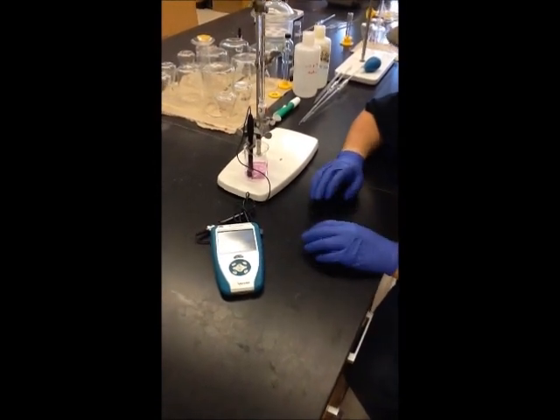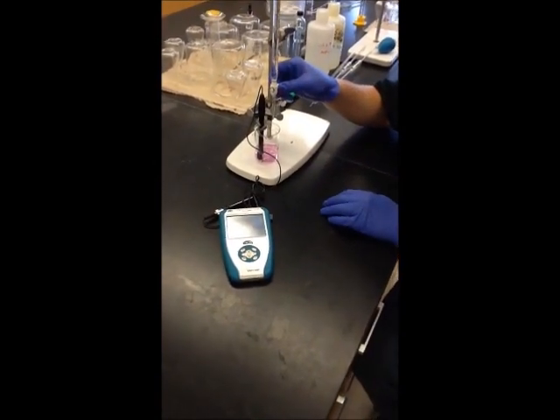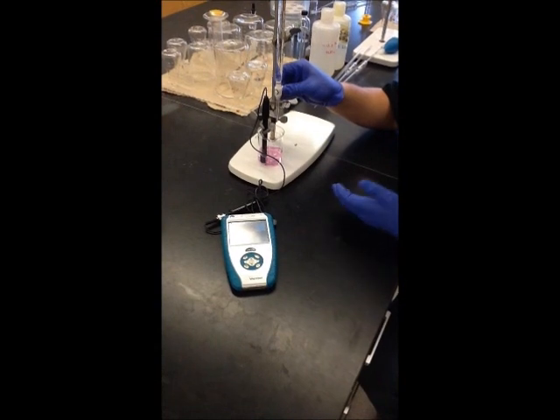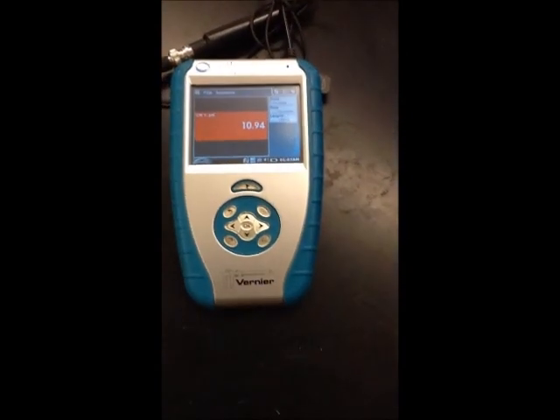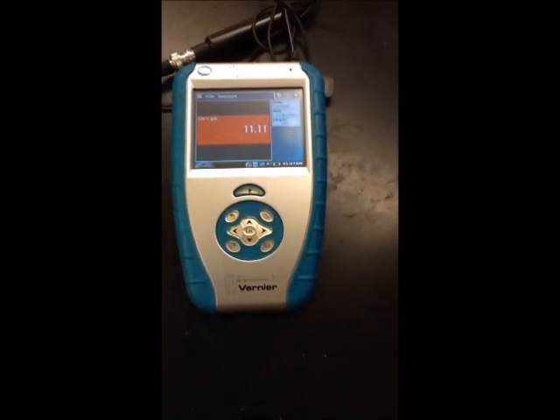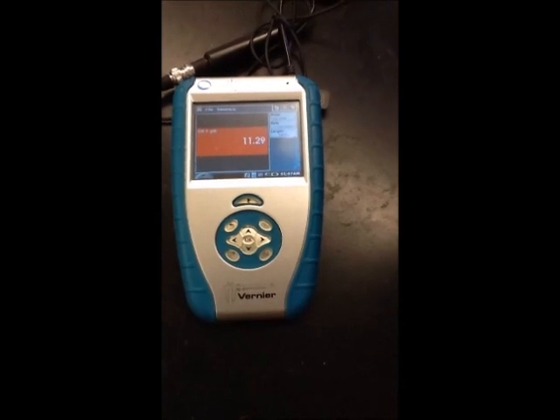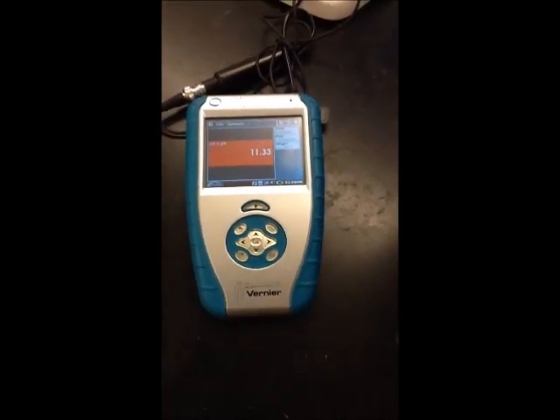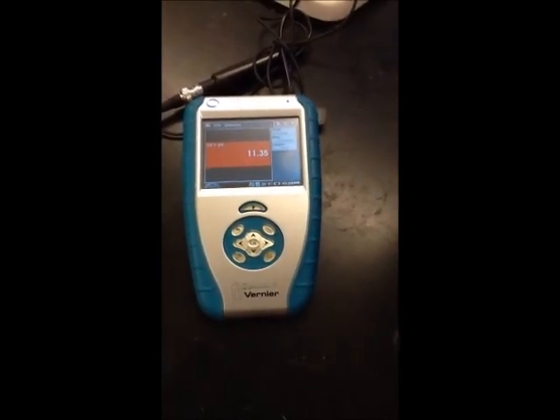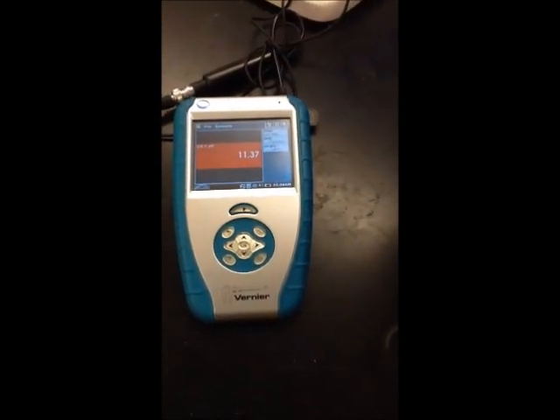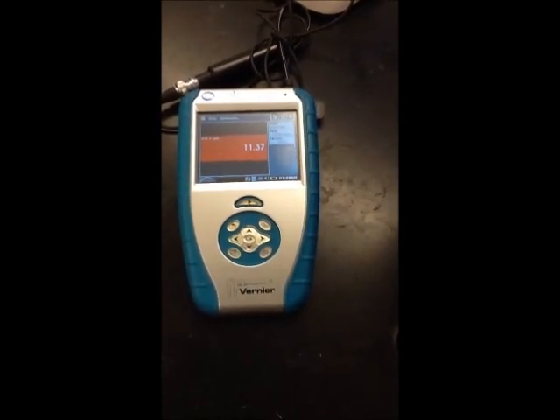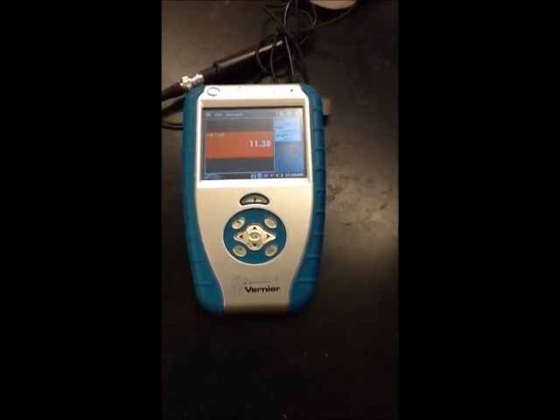After the equivalence point, we can see that the solution is just becoming more basic, and we should see it become more purple. Maybe not, but the pH is definitely rising. I think we've reacted all of our indicator, and that's why it's not turning any more purple. But we can definitely see the pH consistently rising.